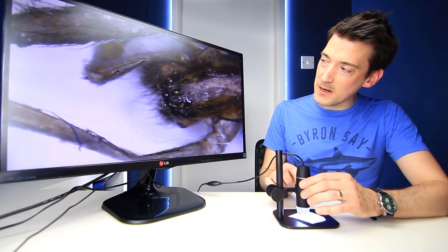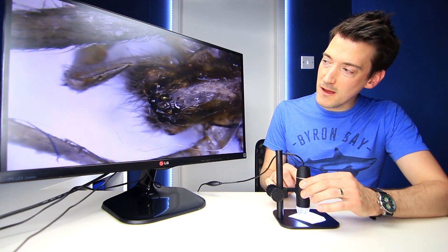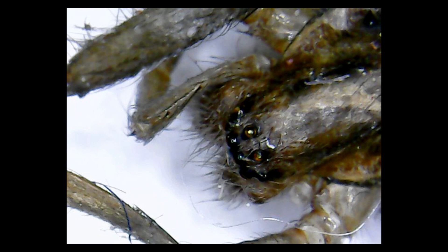We should take a snapshot as well — I'm going to see if I can do it without moving it too much. Well surprisingly, it hasn't actually come out blurred. I was surprised, I really was, because of the amount of movement I was making just trying to take a photo. But if you had to send that to someone, they would clearly see what it was.